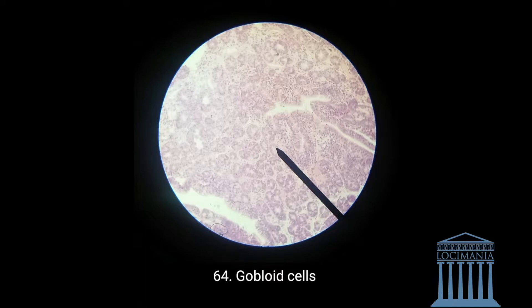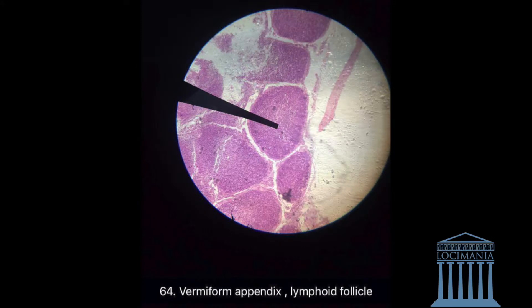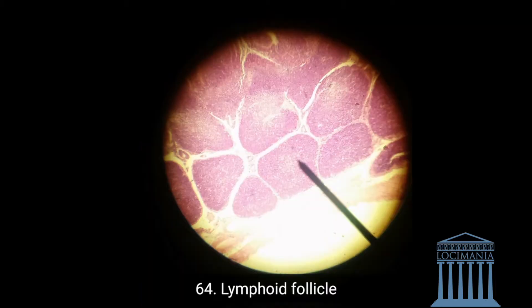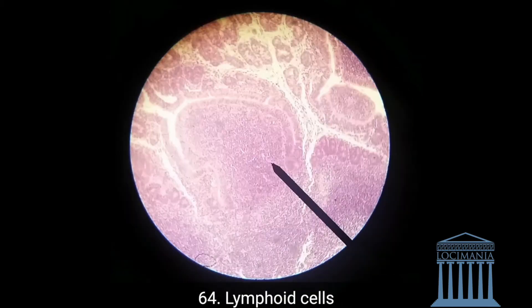Here we have the lymphoid tissue. It is characteristic in that it is surrounded by the epithelium — simple epithelium characterizes the lymphoid tissue. We also have some lymphoid cells here and some connective tissue.